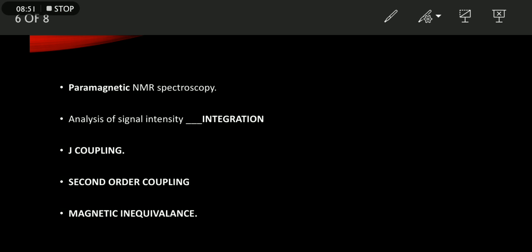If the shift separation decreases, the multiplet intensity patterns are first distorted and they become more complex and less easily analyzed. If more than two spins are involved, especially, intensification of some peaks in a multiplet is achieved at the expense of the remainder, which sometimes almost disappear in the background noise.